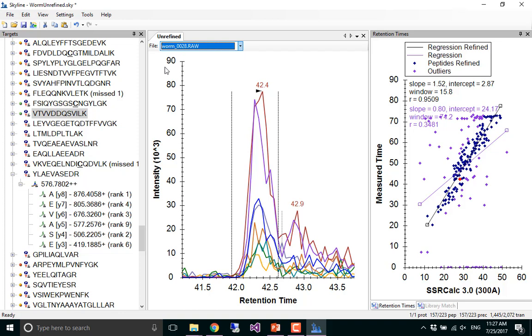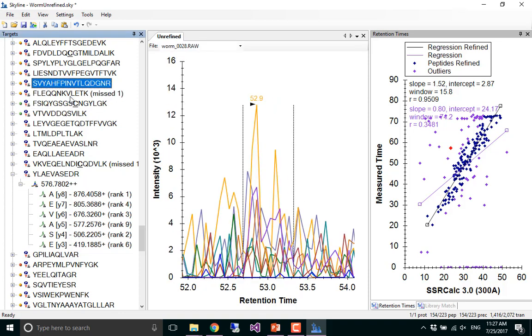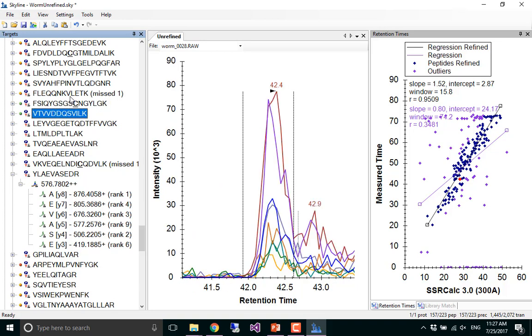And if you continue selecting up, you'll see there's a whole range of peptides that were measured in 27 and 28. So how do you interpret that? What does that mean? What did the instrument operator do? What happened?